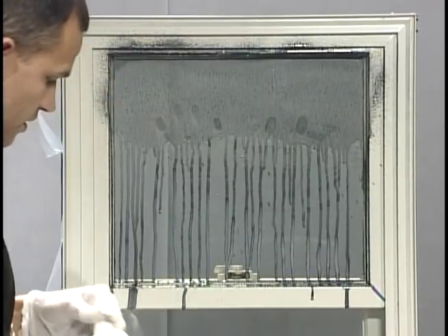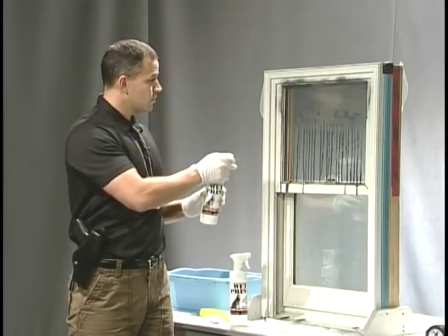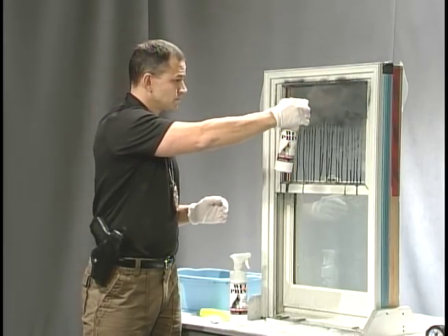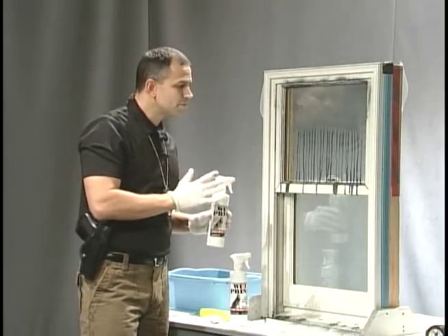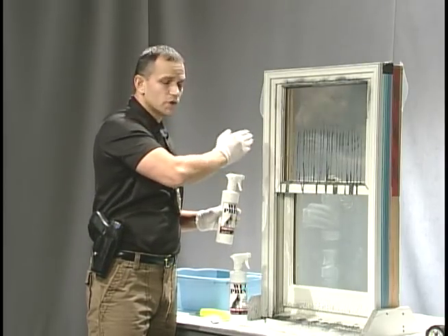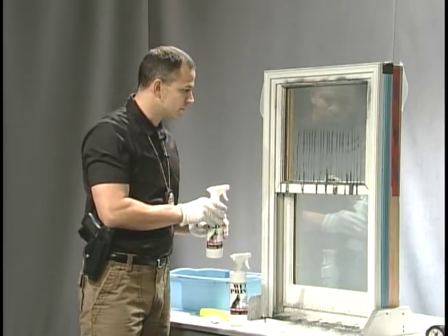Then we're going to take the number two bottle — this is just filled with water — and we're going to spray that to clean up our fingerprints. Again, it's going to be very important to start at the top and let it flow down. You don't want to spray it directly into your fingerprints because you're going to disturb those fingerprint ridges.